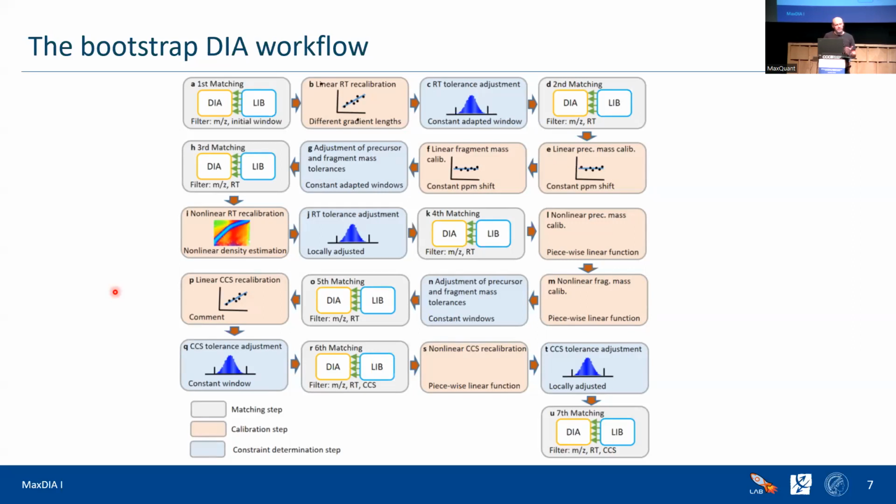So you first make a, actually called, first search to just produce calibration points for doing the nonlinear recalibration. These results are not used for identification and quantification results in the end, but only for calibration. That's a very easy principle, because you have a search engine and you can just run it multiple times, and that's it basically.